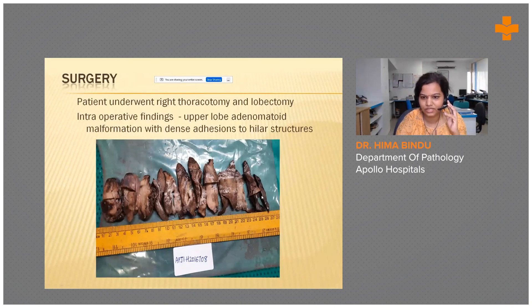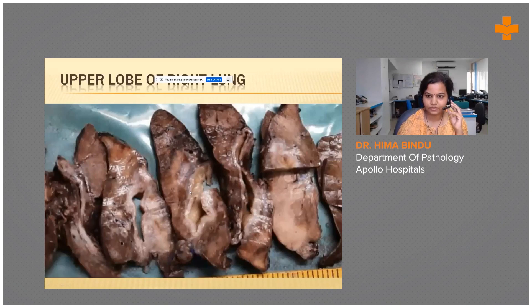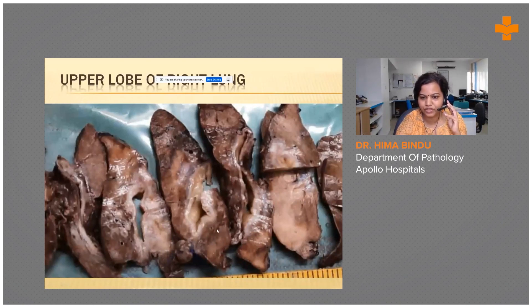These are the serial sections of the lobe, showing the cystic lesion in the center continuous with the hilar structure. The closer view shows a central cyst with a thick wall. The surrounding lung parenchyma was very firm and had lost its regular spongy nature, while the periphery appeared normal with a spongy appearance.